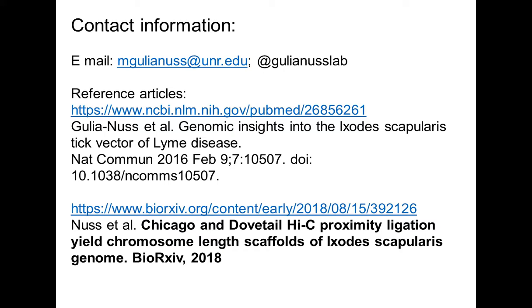It's more conservative, and we got fewer errors. Salsa2 admittedly seemed to provide a little bit higher contiguity, but Hi-Rise was more accurate at the end. I have that data, and if anyone is interested in seeing that experiment, I can provide it.